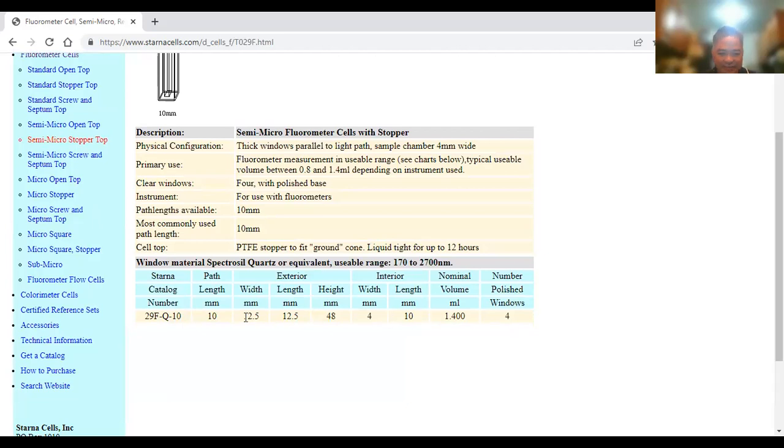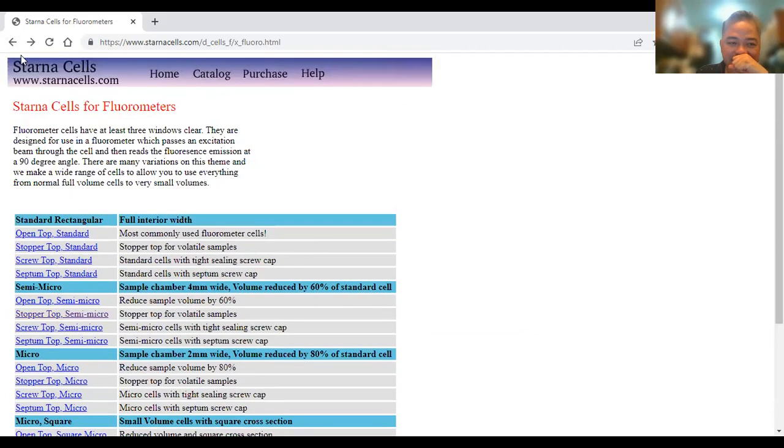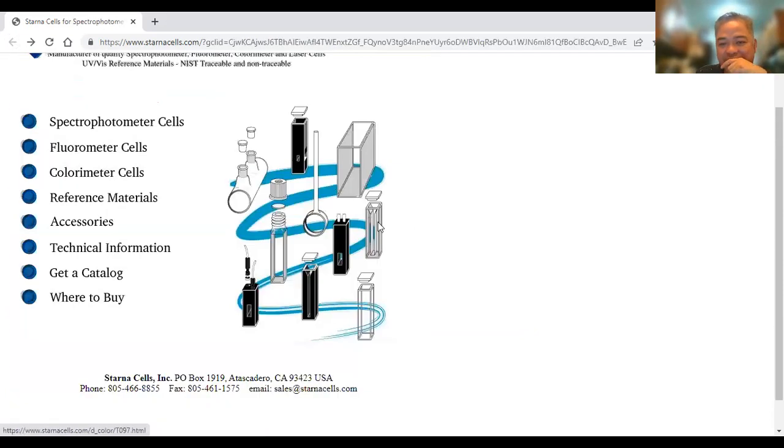So, it tells you the length that you have. So, usually this is 10, that is millimeter, which is equal to 1 centimeter. So ito yung different cuvette. Baka sabihin nyo, ito lang yung alam kong cuvette. Okay? Medyo, yung iba nga medyo manipis pa eh.